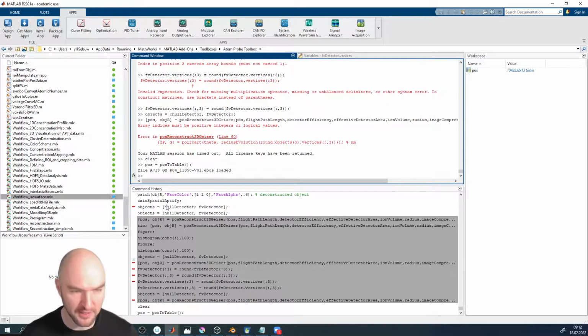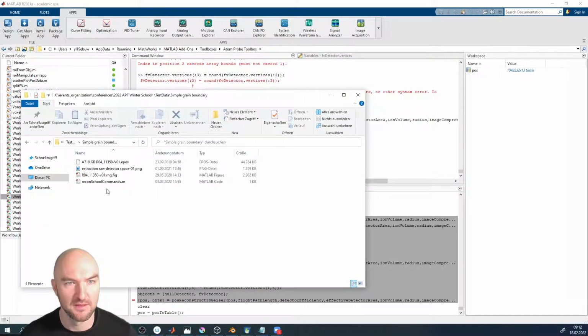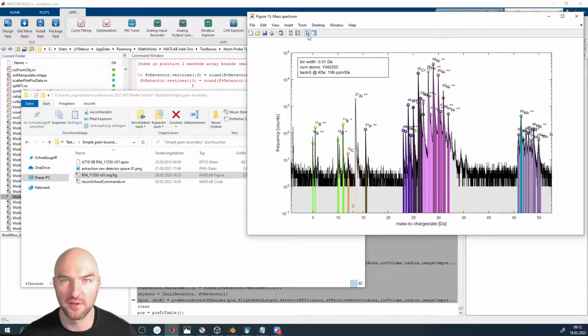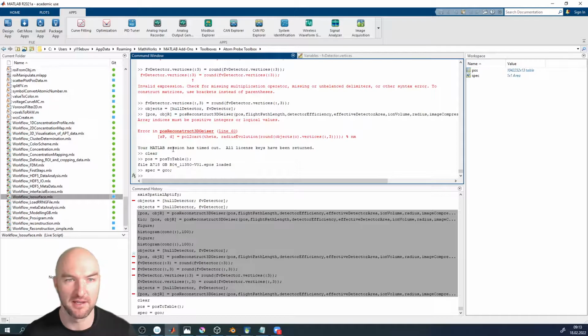The next thing we're going to do is open the range figure. I just need to double click on that one, and it will pop up. Then make sure that we have a variable representing the mass spectrum. So I'll just click anywhere on the base mass spectrum curve, not one of the ranges, but the base mass spectrum curve, and then pull out the object that this represents by using get current object as the command.